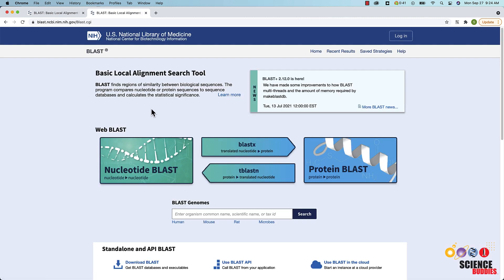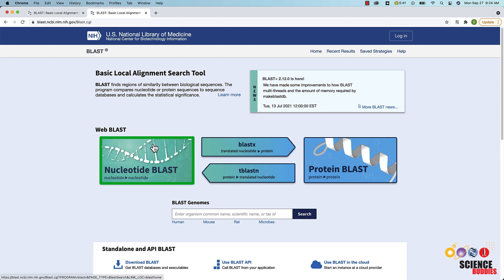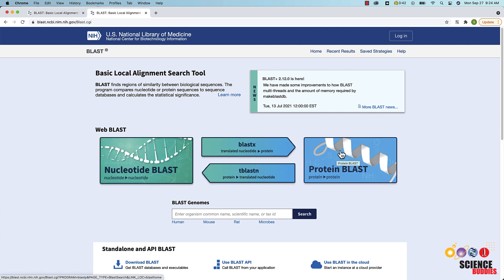When you get to the BLAST main page, you will see different BLAST options. You can do a nucleotide BLAST which compares nucleotide sequences. This is useful when trying to determine the evolutionary relationships among different organisms. The protein BLAST compares protein sequences and is useful when trying to identify a specific protein.